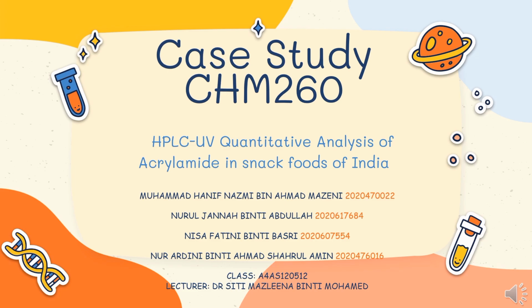Our title is HPLC UV Quantitative Analysis of Acrylamide in Snack Foods of India.